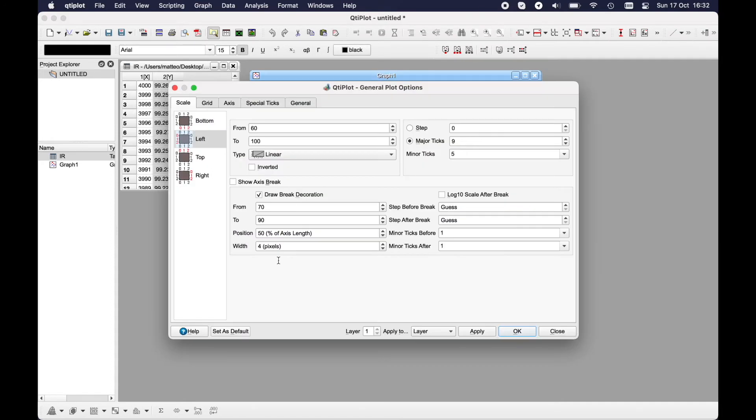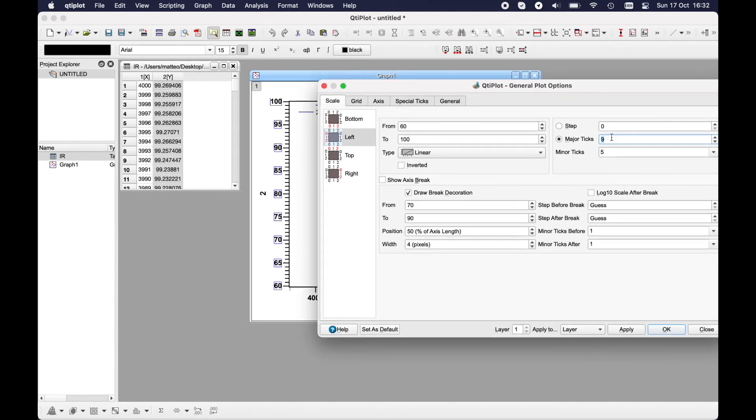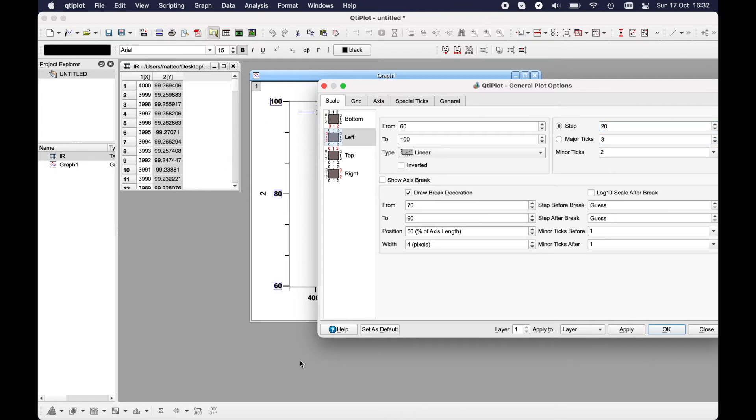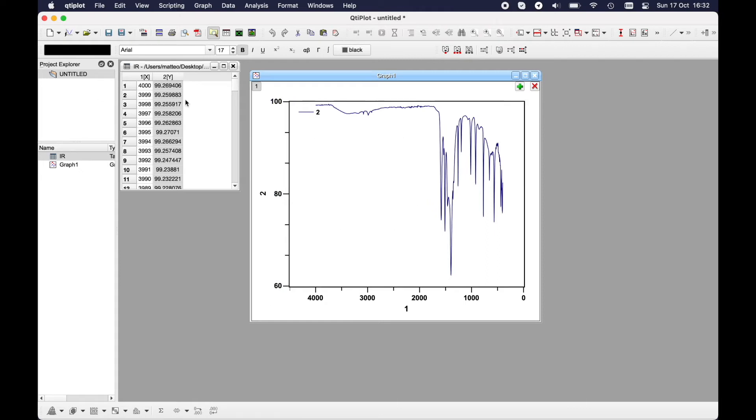Here you can also play with the steps. For example here is zero, you can put for example 500 and you will have each tick of 500, or 1000. And here we go.